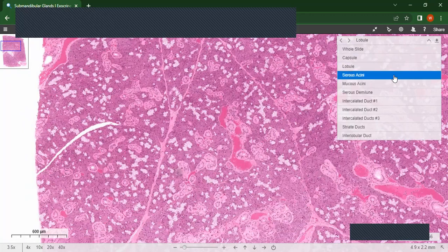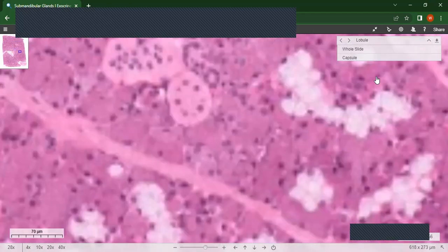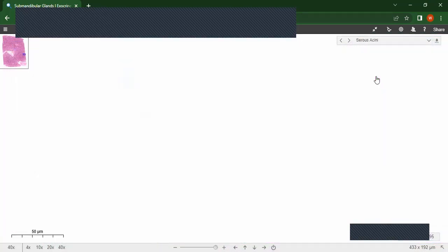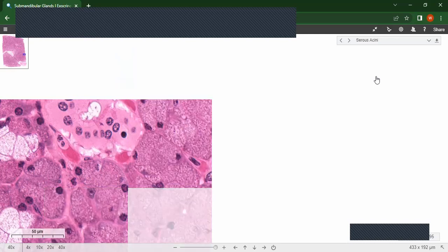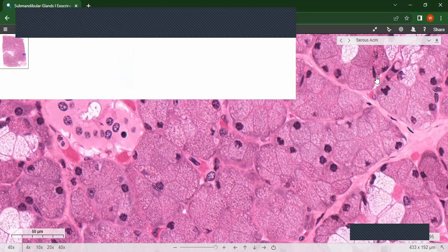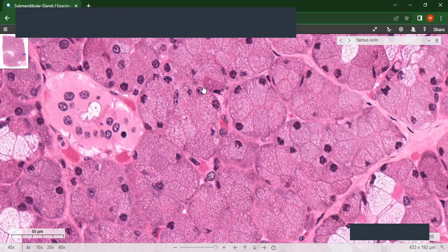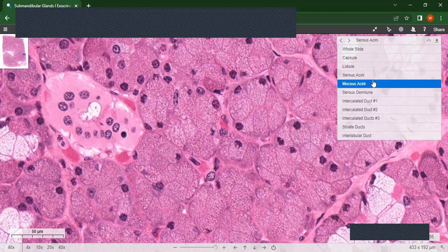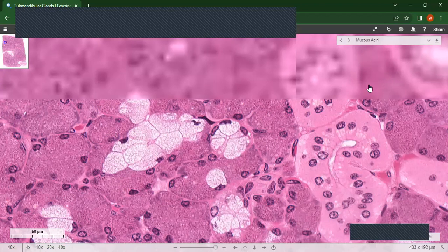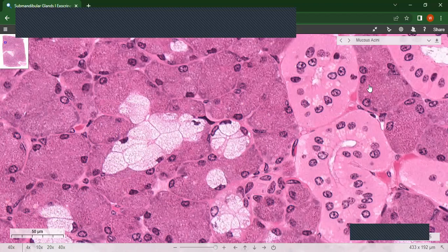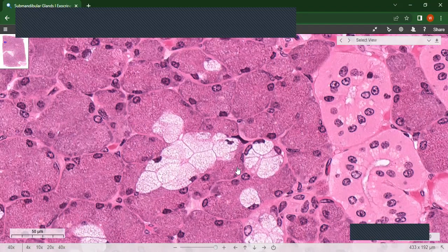It is seromucous, so it has both serous acini and mucous acini. The serous acini take up the stain — this is the H&E stain — so you can see these are the serous acini. The mucous acini do not take up the stain. These are the mucous acini. That is why the submandibular is a seromucous salivary gland.